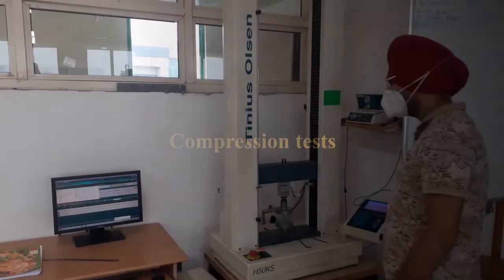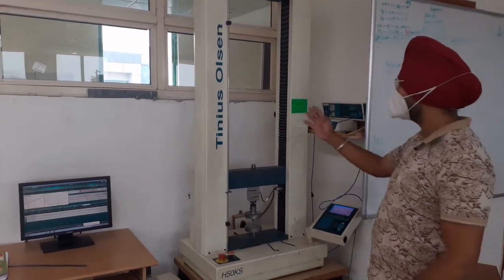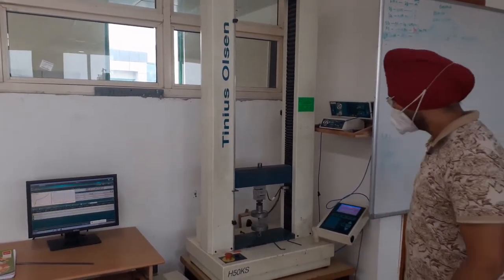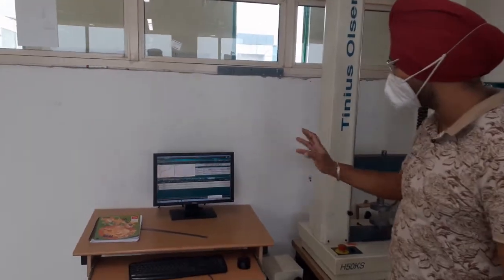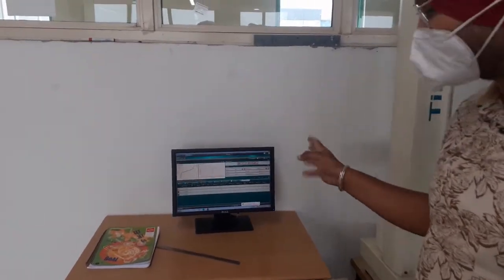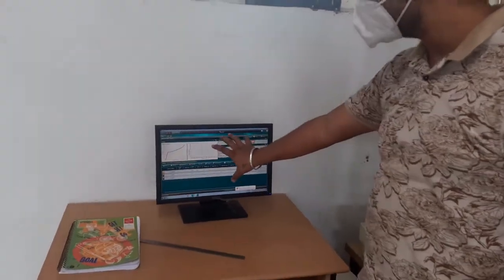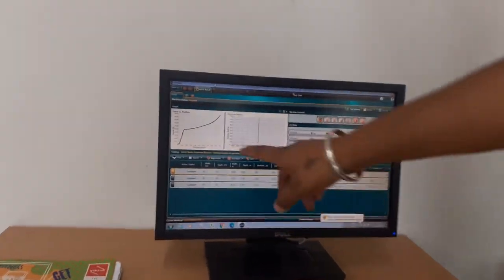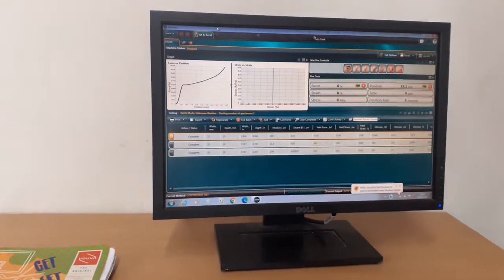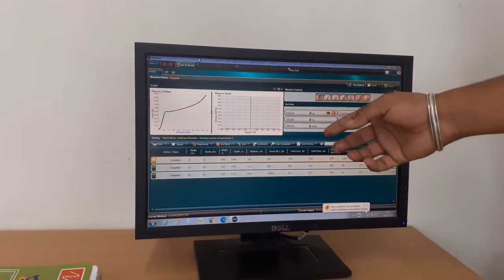Hello students, today we are doing an experiment on compression test by using the UDM. The software is the same for this test which we used for the tensile test, this is the Tinius Olsen software. Here we have to put the width and depth of our sample, and the values of force, stress, position, time, and position rates will show here.